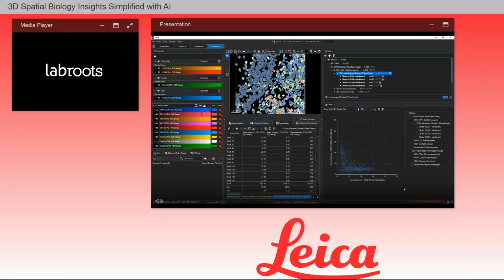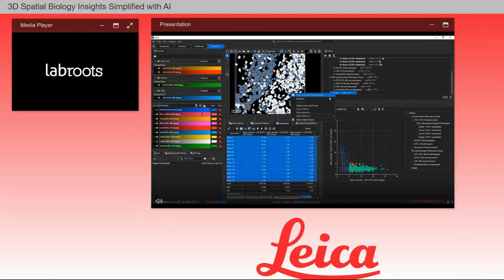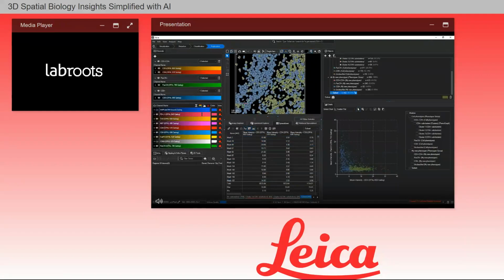You can see two divergent clusters of data points in the scatter plot. I can use rubber band selection to select a group of cells that have high CD3 mean intensity, and use the gate button in the spreadsheet to create a subset manually. I'm going to deselect the objects and spotlight this subset. With this subset, I can perform additional secondary analysis or go back to my classification tab to create more clusters.